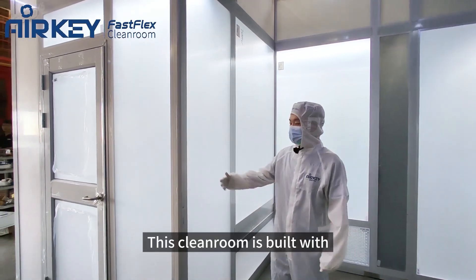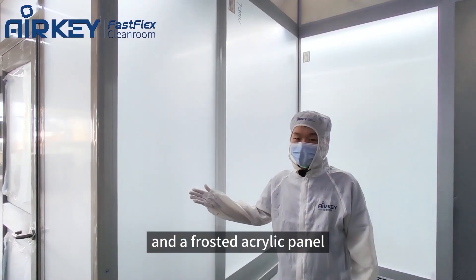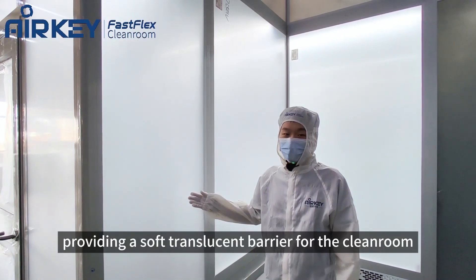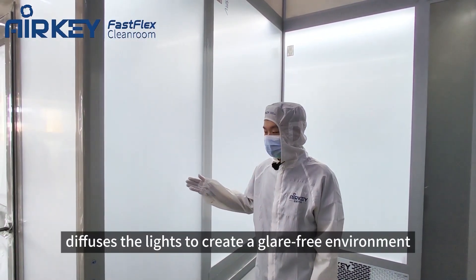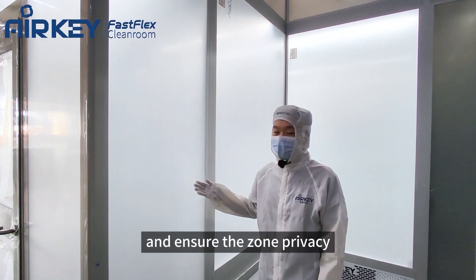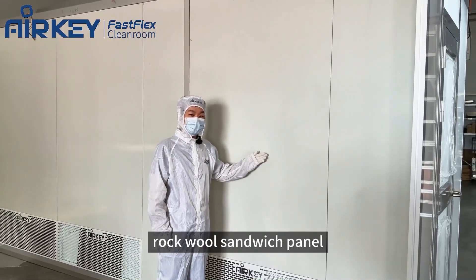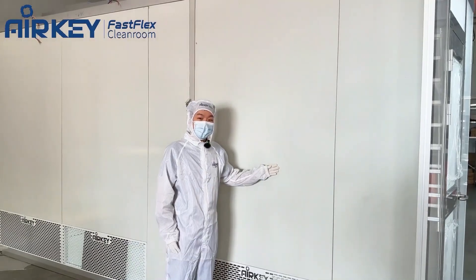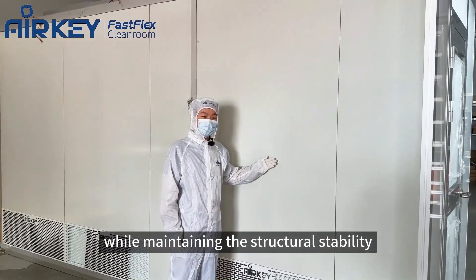This cleanroom is built with high strength aluminum profile and a frosty acrylic panel providing a soft translucent barrier. The textured surface diffuses the light to create a glare-free environment and ensure zone privacy. The cleanroom is also equipped with rock wool sandwich panel providing superior thermal insulation and fire resistance while maintaining structural stability.